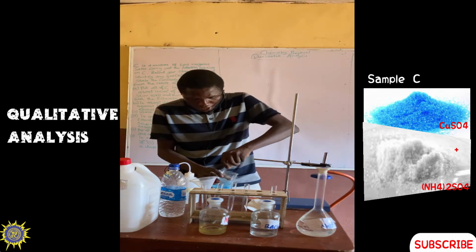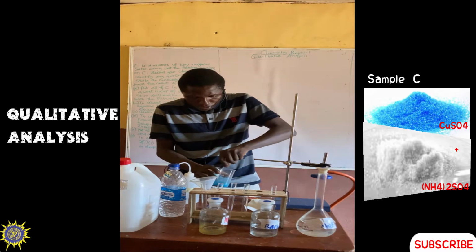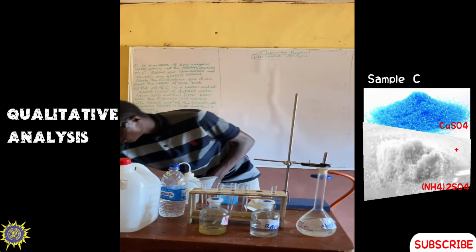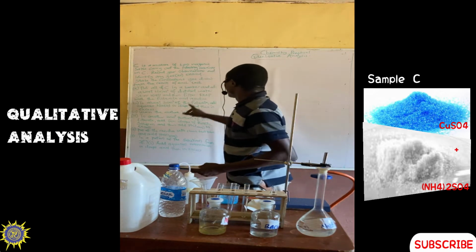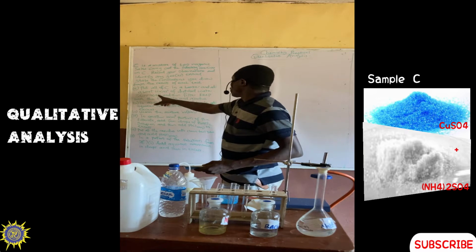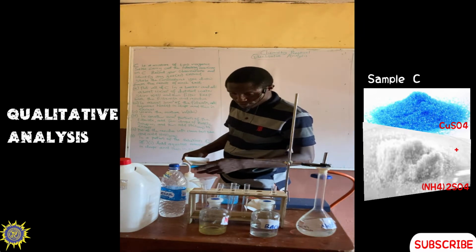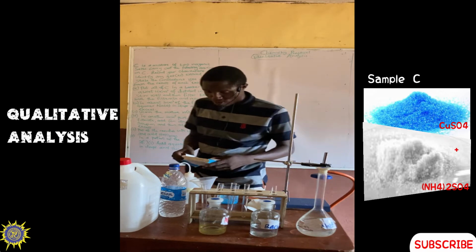So we have added our 10 cubic centimeters of water to the mixture. So I'm stirring now. The stirring has been done now. Stir well and filter. Then we have to filter now. We have stirred. Let's filter. Now using your filter paper.